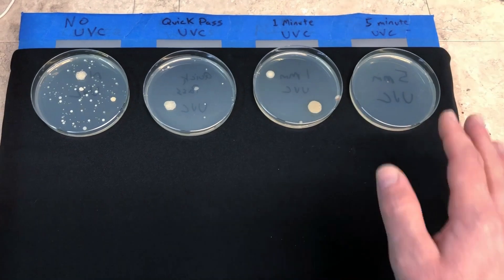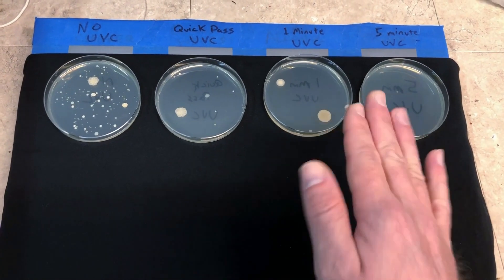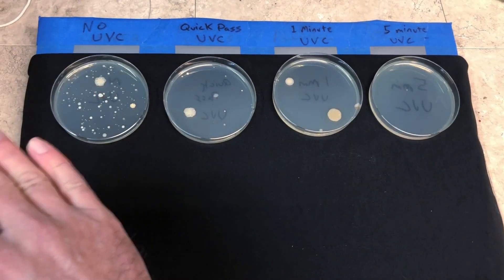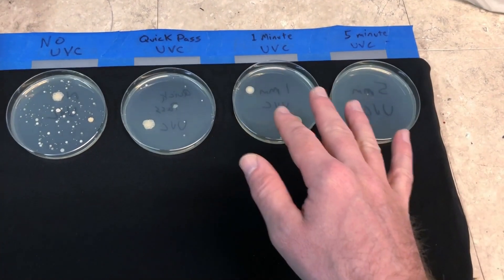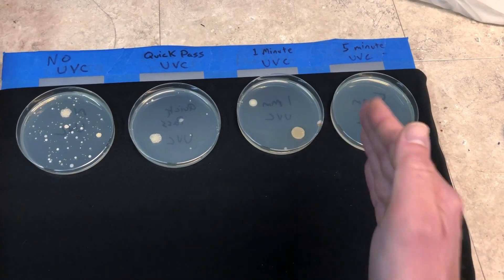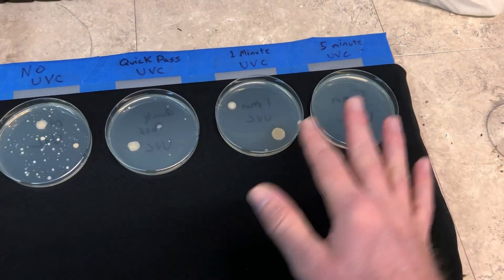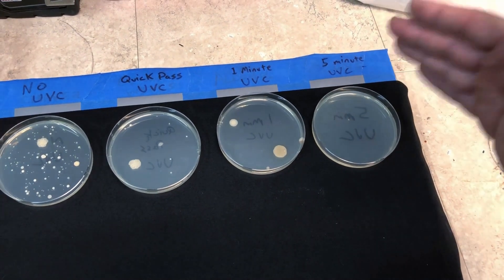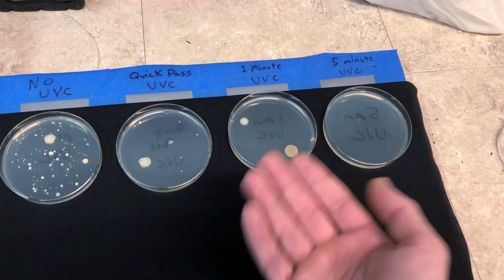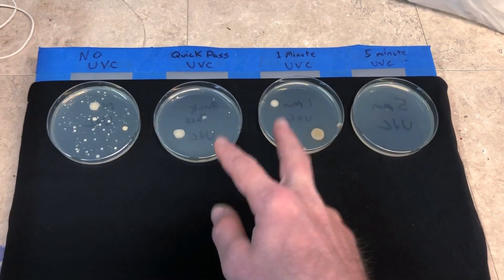Now we're going to dirty up some new petri dishes — I'll touch four dishes with my hands. One will go in the incubator without any UVC exposure. The other three will be placed around the space and we'll run the light for roughly 20 minutes. We could calculate using the inverse square law exactly how long to expose them for 99–100% sterilization at a given distance, but the average person buying this light isn't going to do that — so we'll just set a time and see the results.